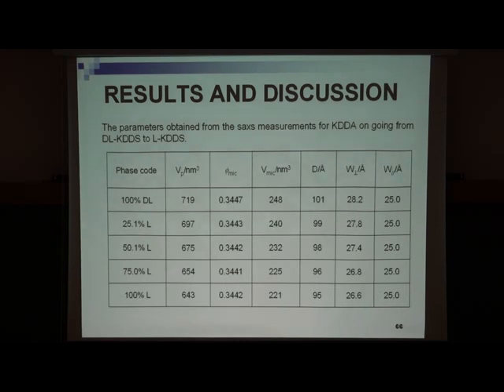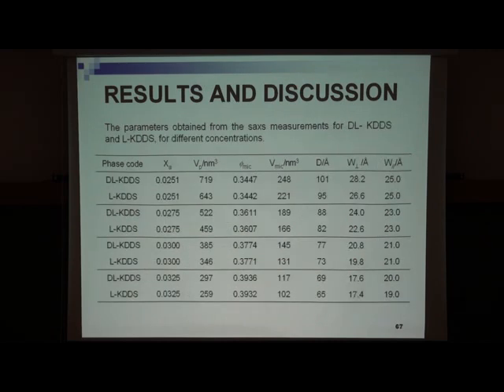Similar results were obtained for serine systems. And the nematic phases have a smaller micellar volume and smaller micellar distance. And this is similar to the alanine systems.